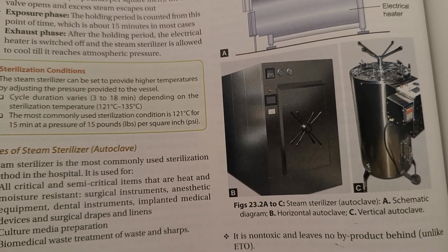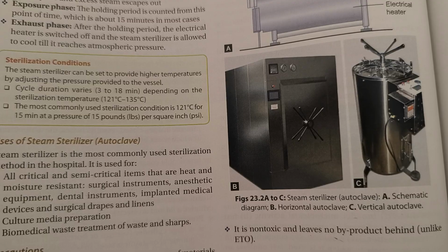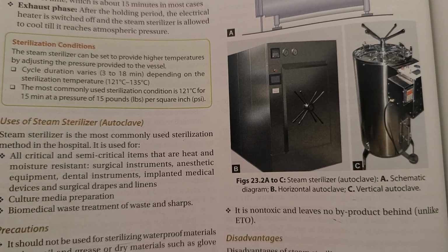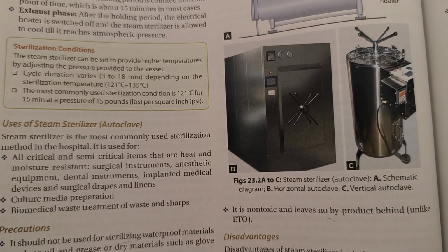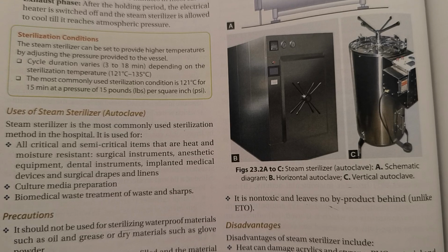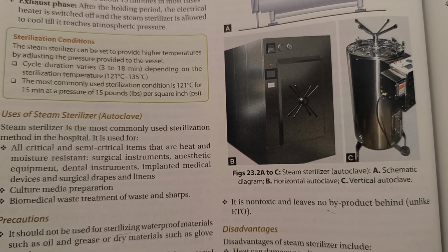Exposure phase. The holding period is counted from this point of time, which is about 15 minutes in most cases. Exhaust phase. After the holding period, the electrical heater is switched off and the steam sterilizer is allowed to cool till it reaches atmospheric pressure.